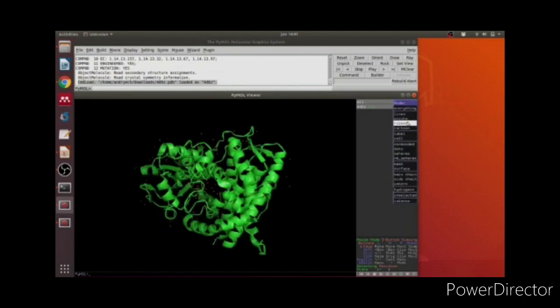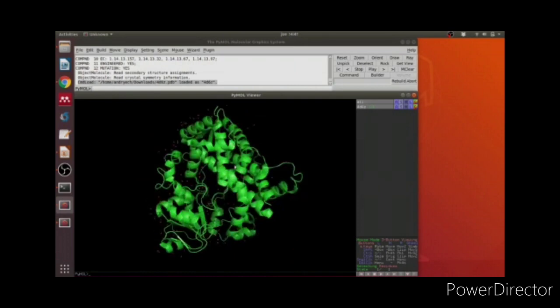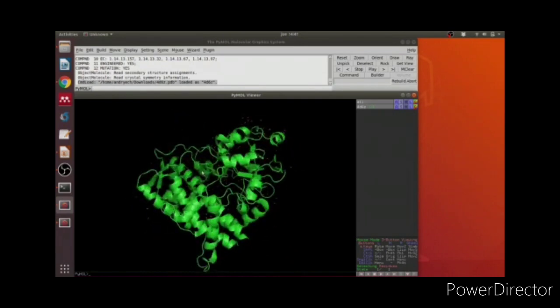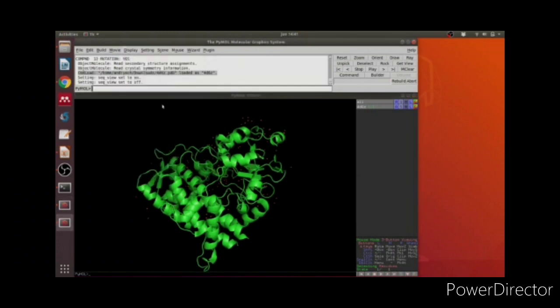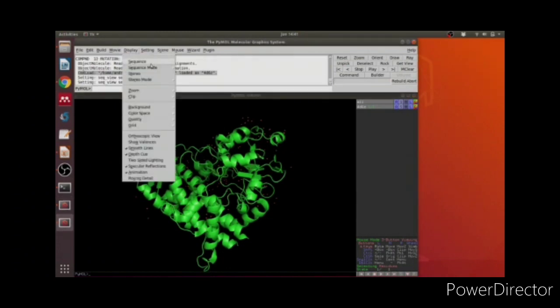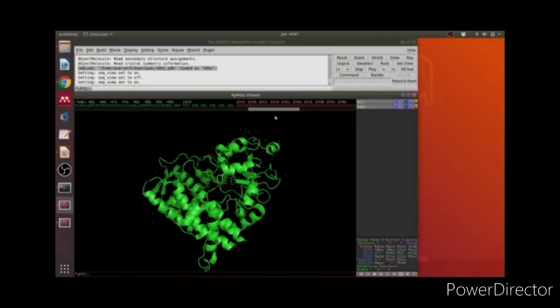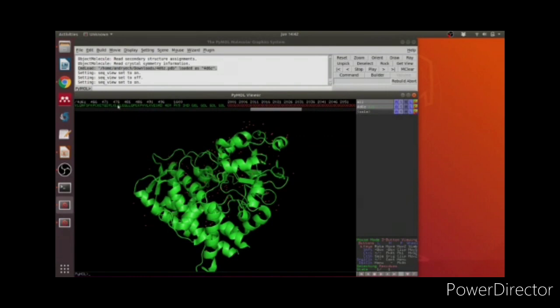The Py part of its name alludes to the fact that it is extended with the Python programming language, so it can be extended to perform complex analysis of molecular structure using libraries available for Python such as NumPy or Pylab.